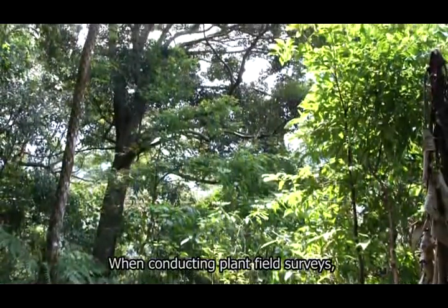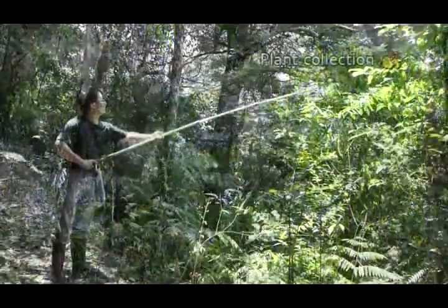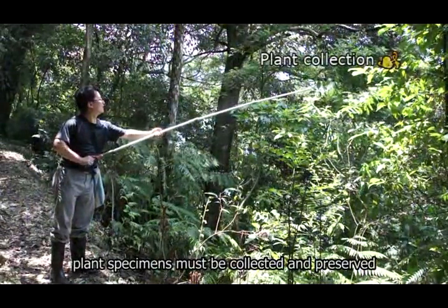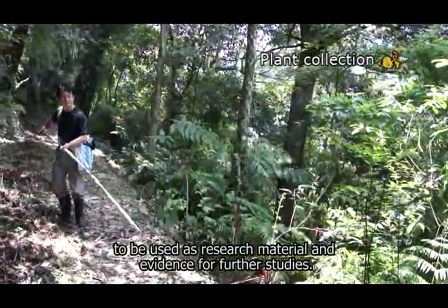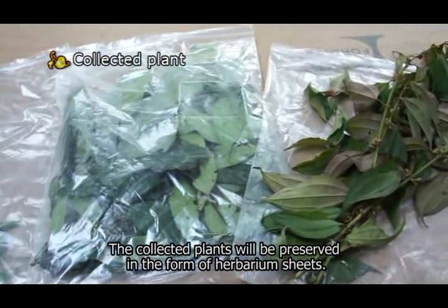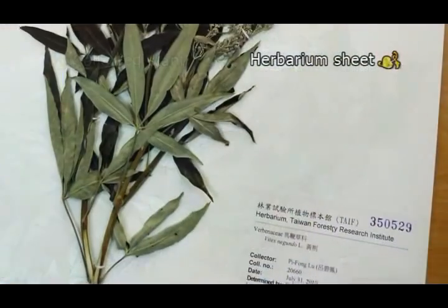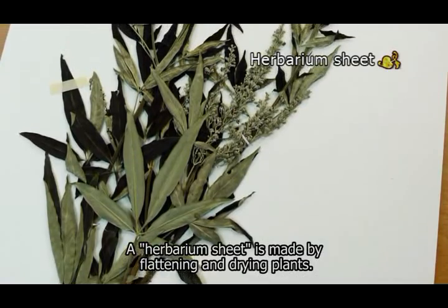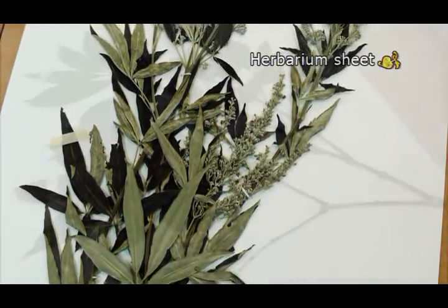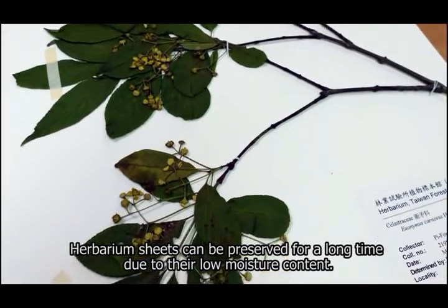When conducting plant field surveys, in addition to making field observations and keeping records, plant specimens must be collected and preserved to be used as research material and evidence for further studies. The collected plants will be preserved in the form of herbarium sheets. A herbarium sheet is made by flattening and drying plants, and can be preserved for a long time due to their low moisture content.